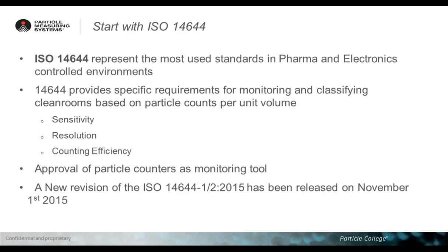So why is ISO 14644 extremely important, even relating to this topic? As you may know, this is probably the most used standard in the pharmaceutical and electronic controlled environment. It provides specific requirements for monitoring and classifying the cleanroom, and it also provides a kind of approval of the particle counter as a tool, as a device for controlling your particle contamination.